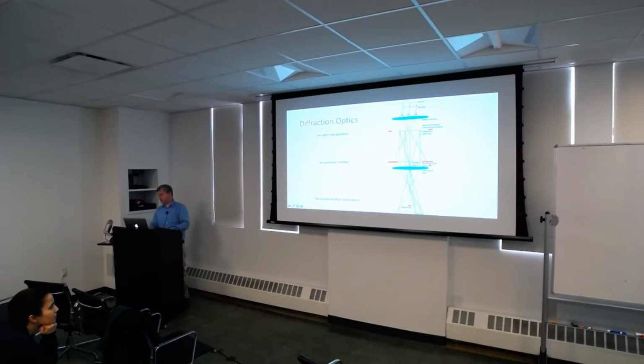In a way, it's easier to set up than regular imaging, because you're not forming images. You're just collecting the diffraction patterns. The main thing is to limit the diffraction astigmatism and make sure the diffraction beam is going right down the center of the column, but you don't have to worry about objective astigmatism and things like that, because you're only collecting diffraction spots.